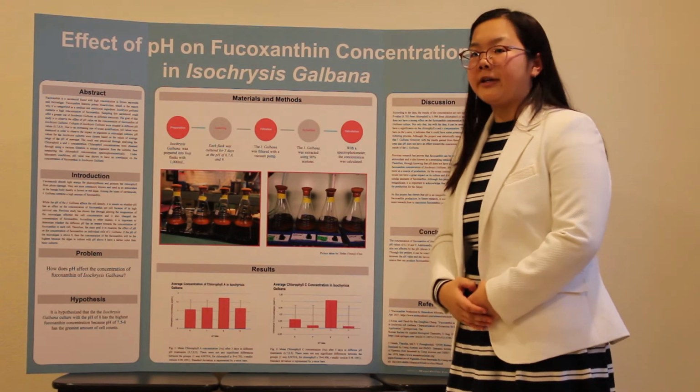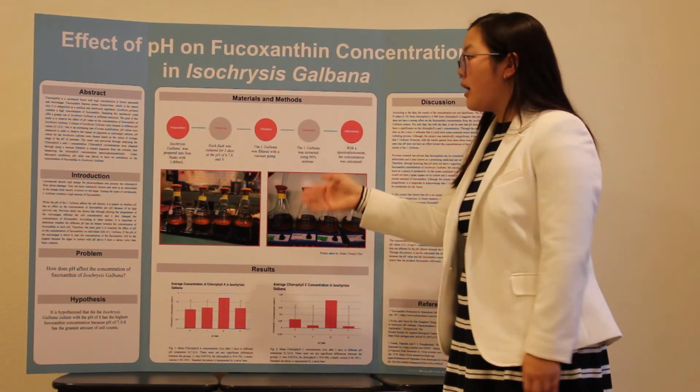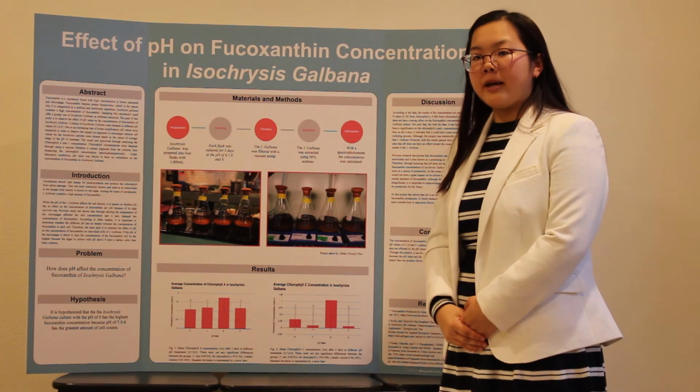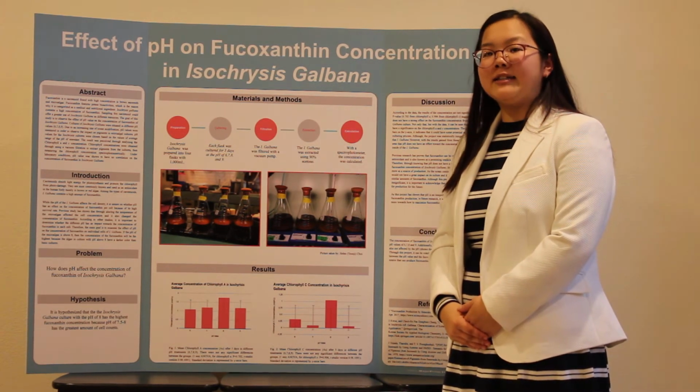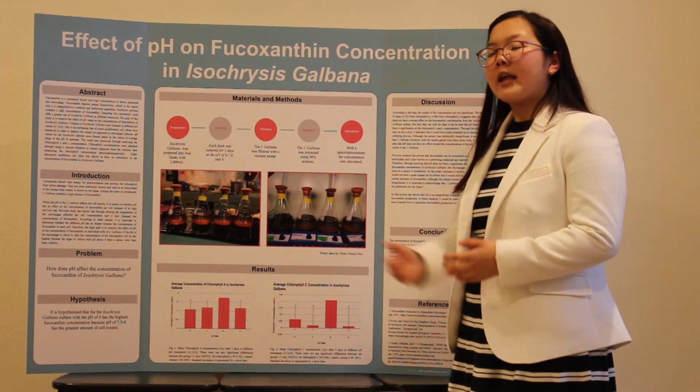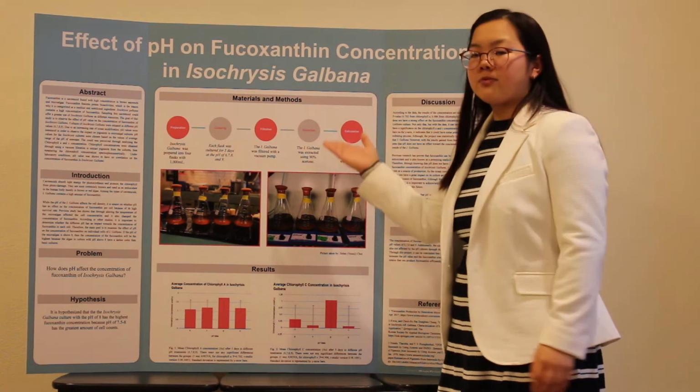After the 3 day period, the filtration process occurred. The Isochrysis gabana was filtered with a vacuum pump. The filtration paper was put under desiccation at -20 degrees Celsius, and stored for up to 30 days. After those 30 days, the extraction process occurred.